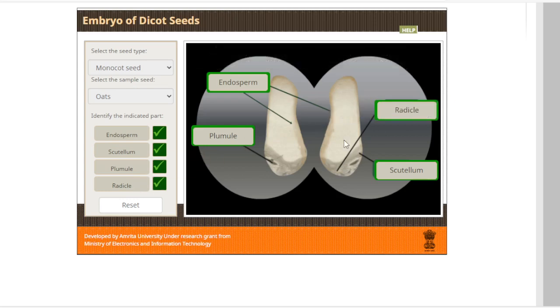ऑलराइट. So well, this way we have checked out these monocot seeds और हमने देखा है कि मोनोकॉट्स का जो एम्ब्रियो का होता है स्ट्रक्चर वो डिफरेंट होता है. मोनोकॉट सीड्स का जो इंटरनल स्ट्रक्चर होता है वो डाइकॉट से जो है बहुत ही डिफरेंट होता है, राइट. और उसी हिसाब से नॉमेनक्लेचर भी डिफरेंट हमें देखने को मिलता है. सो वेल, दैट वाज अबाउट द मोनोकॉट्स. थैंक यू.